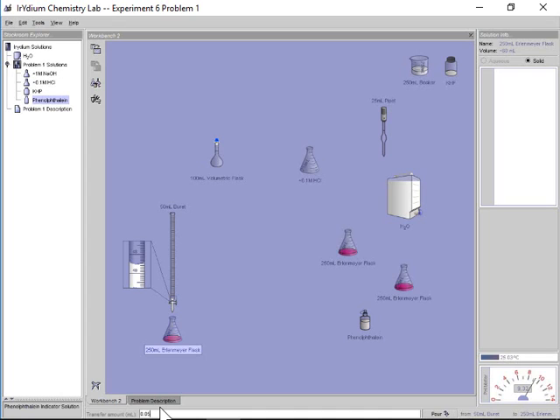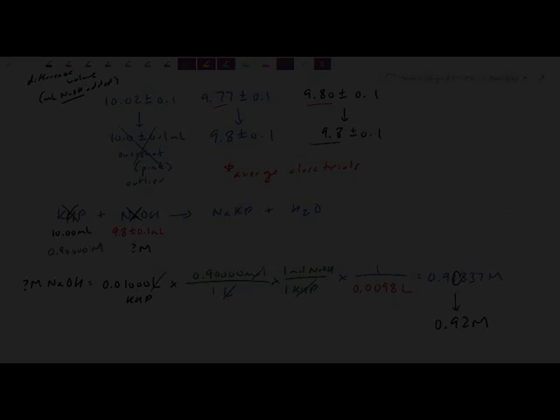I'm going to show you some of these calculations here. Again, it was a little bit of work to actually do these titrations here. I demonstrated for you some errors that came into play and how you would address some of these issues. So with that, let's switch over to the OneNote.